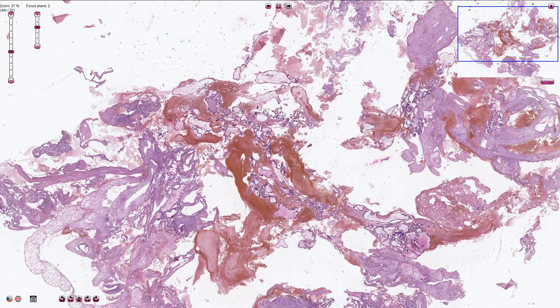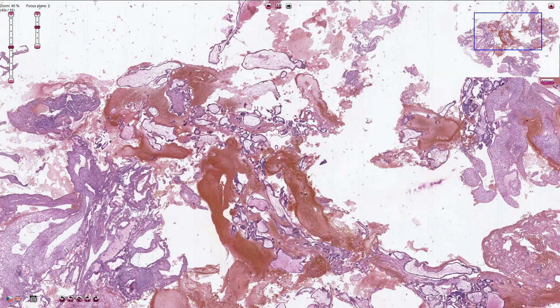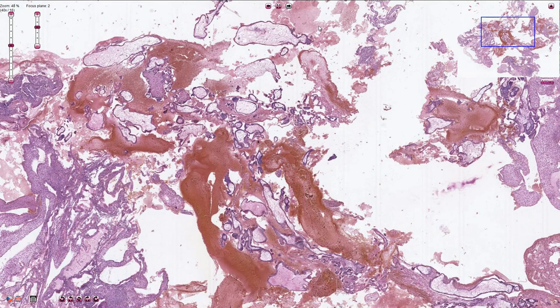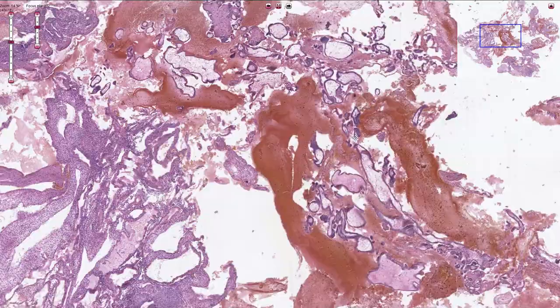If we don't see chorionic villi, then extrauterine pregnancy cannot be excluded based on the histological examination. This product of conception consists of blood. We also commonly see fibrin. Here we have the chorionic villi, which is the most important component.